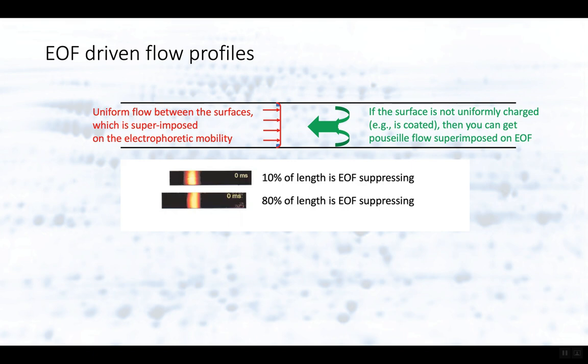They build up some pressure, and the back pressure will cause the contents to start pushing back and forming that bullet-shaped thing that we saw in the capillary chromatography lecture. This ends up causing a mixing inside the flow channel, which completely destroys your separation.